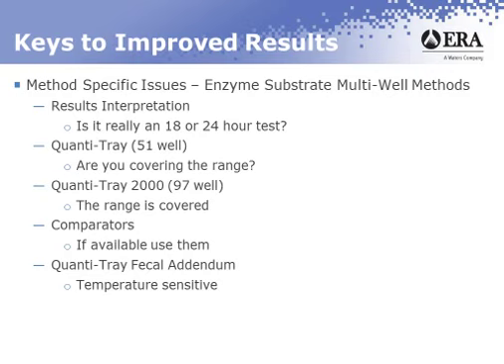Normally that test incubated at 35 degrees C determines total coliforms and E. coli. By incubating it at the elevated temperature, it's been written in the method and not completely approved, but approved some places, that you can determine fecal in that fashion.